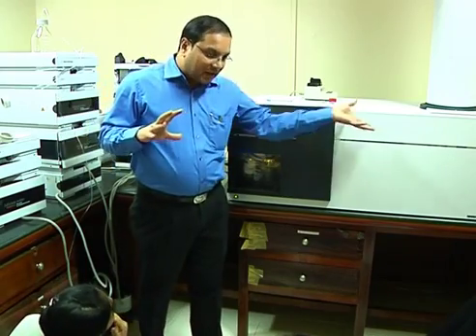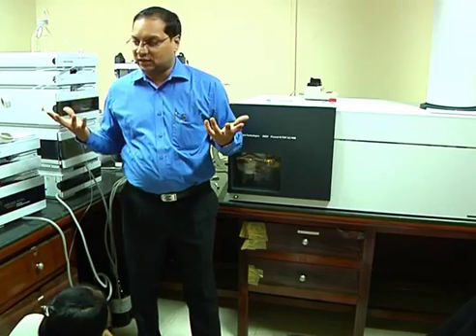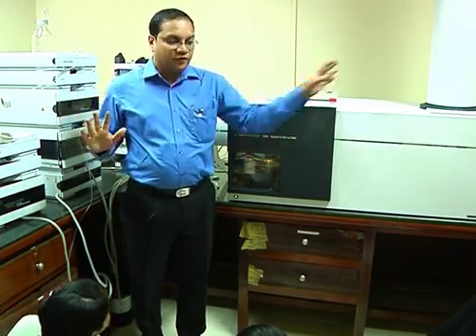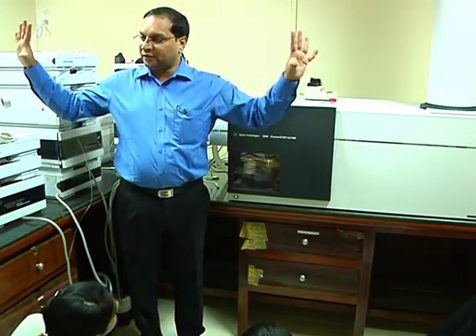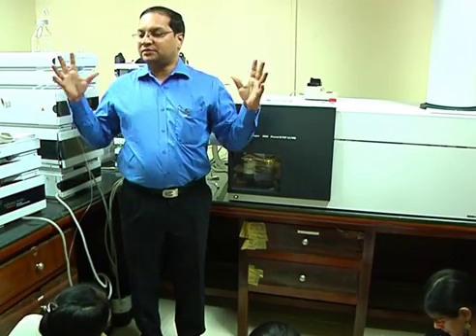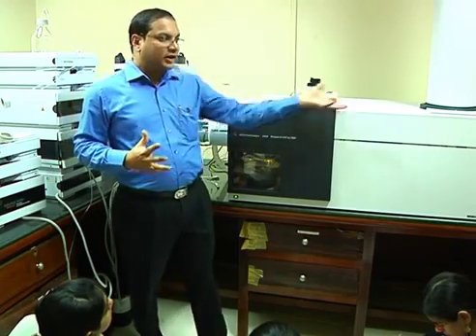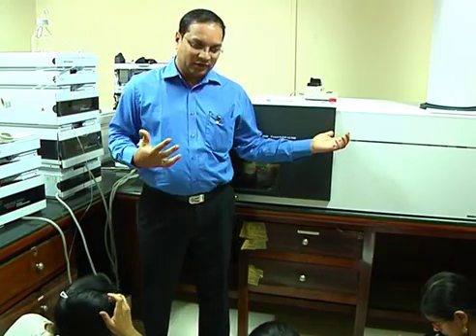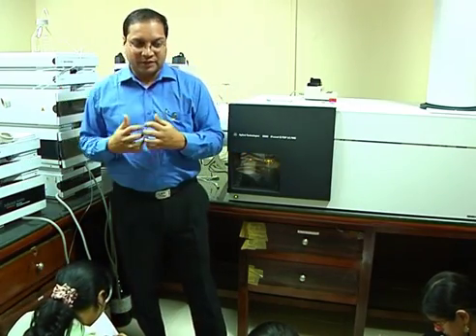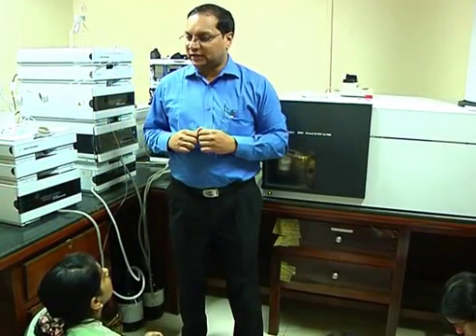If there are two different analyzers, like here in this case quadrupole and time of flight, then it is also called a hybrid mass analyzer, because quadrupole in itself is a mass analyzer, time of flight in itself is a mass analyzer. Two different mass analyzers coupled with the functionality of MS becomes a hybrid mass analyzer or hybrid tandem MS. Because in this case, quadrupole and time of flight are also talking to each other with MS/MS, also called data dependent acquisition and all those things you might have heard. And we need to have two different analyzers.